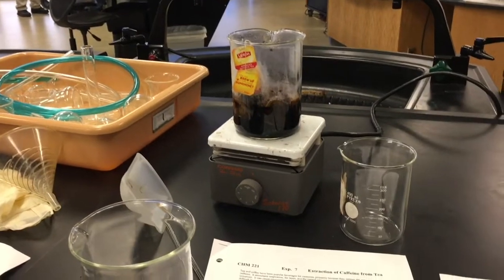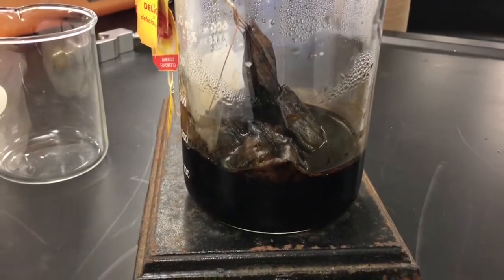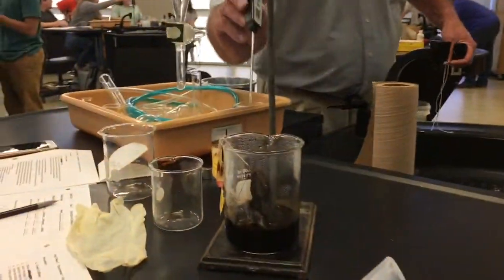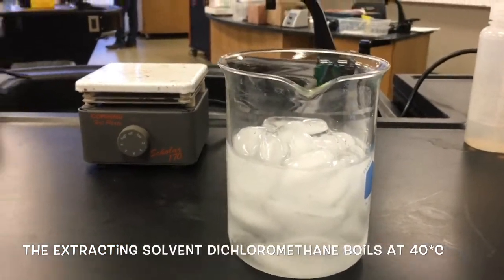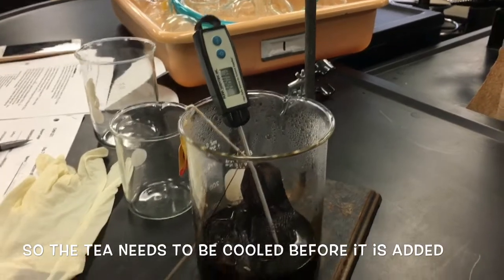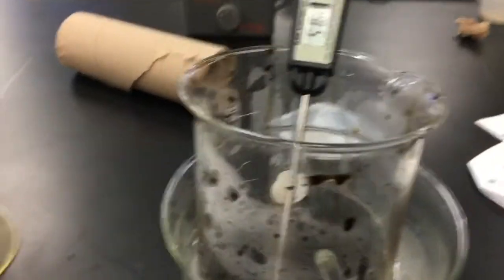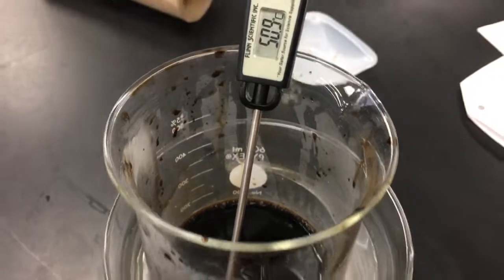Mr. Land doesn't want us to be aggressive. So we have removed this from heat and it looks disgusting. We have extracted our tea bags and our tea looks disgusting. Okay, and we are cooling — that's what we have to do.